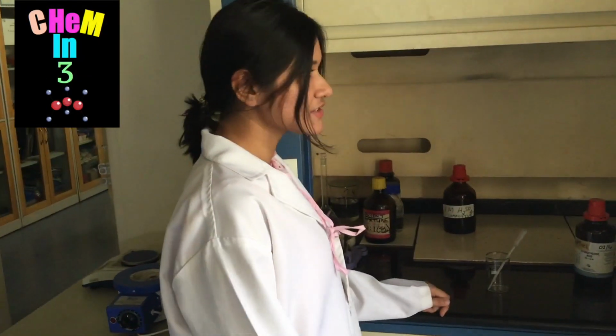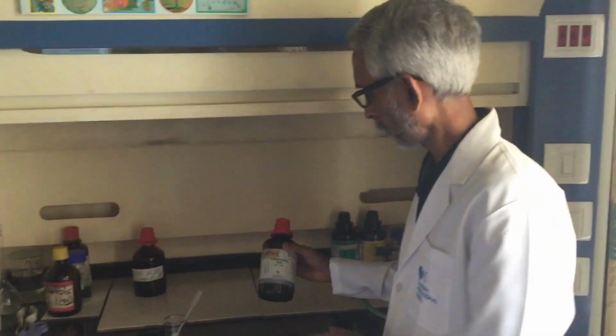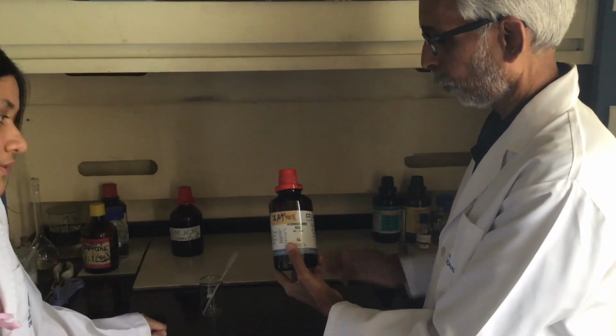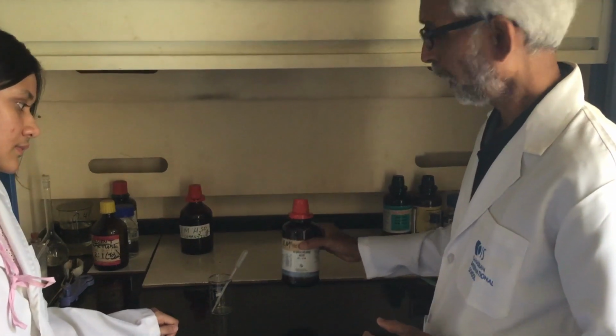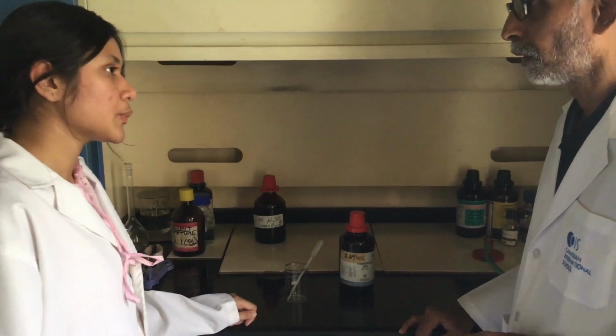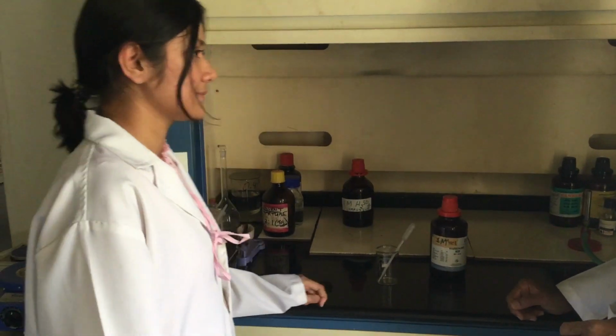Mr. Ranjan, I need 0.01 molar of hydrochloric acid for my EE. Yeah, sure, why not? I have 1 molar HCl with me. So you know how to make whatever molarity you want? 0.01 molar. So you know how to go about it?